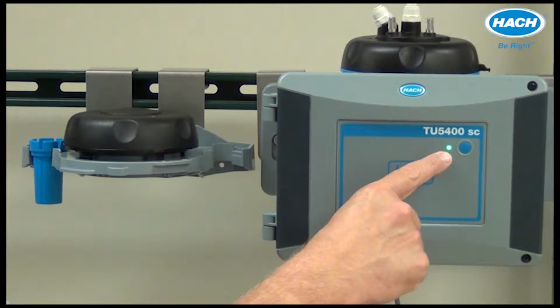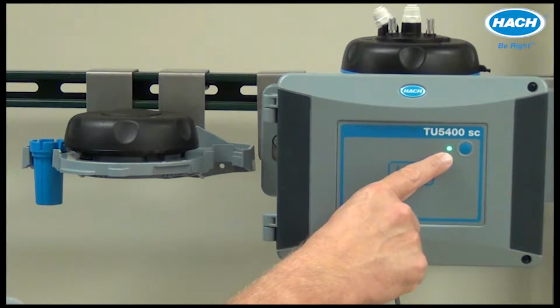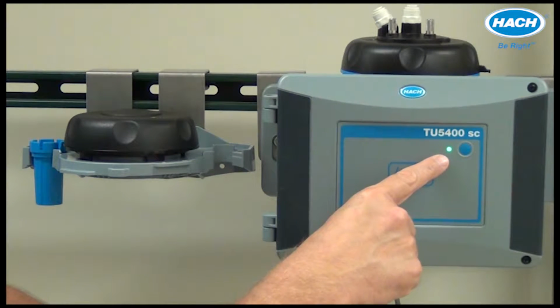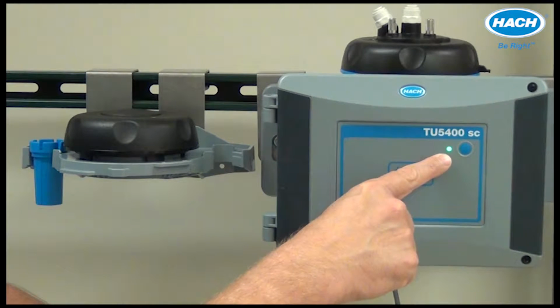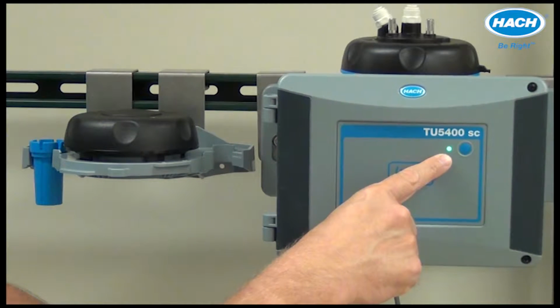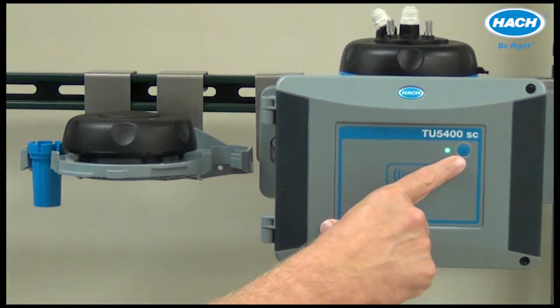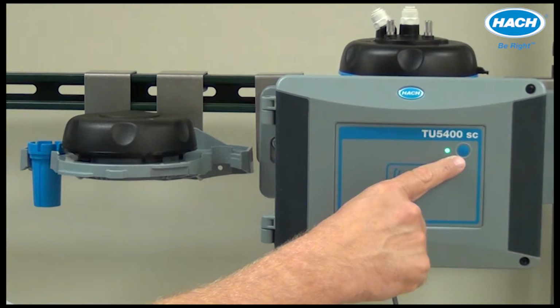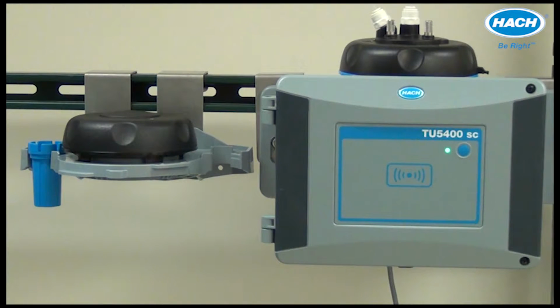But generally speaking, the green color indicates that the instrument is operating without issue. No warnings, no errors, and no reminders. Yellow indicates a sensor warning, red indicates a sensor error, and blue indicates that the instrument is in a calibration or verification activity. The blue button on the front of the instrument can be configured to perform different functions as shown later in this video. For example, the button can hold the outputs for maintenance or service activities.